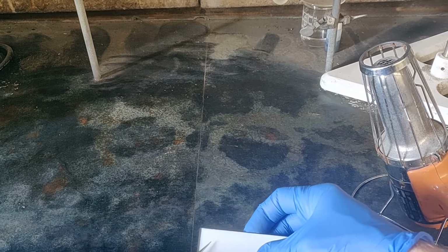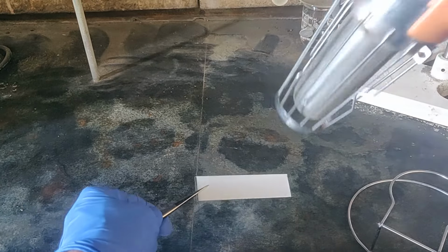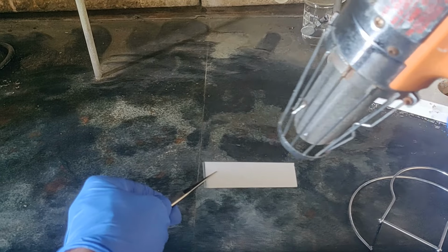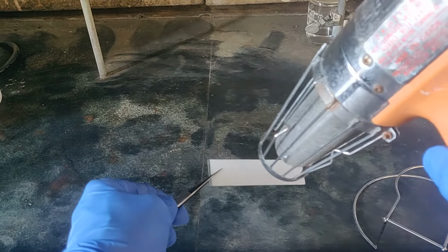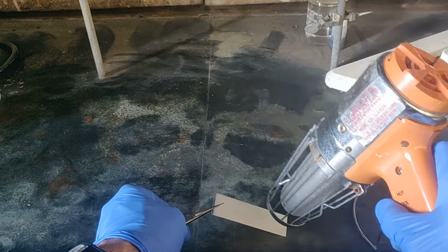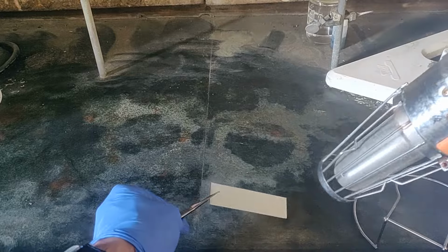Next, you must evaporate the eluent from the plate's surface. You can hold the plate with forceps while drying it for about 30 seconds with a heat gun set on cool. Do this step in a fume hood to avoid inhaling solvent vapors. You can also place the plate flat on the bench top to dry it while holding the plate down with forceps to prevent it from being pushed along by air from the heat gun.